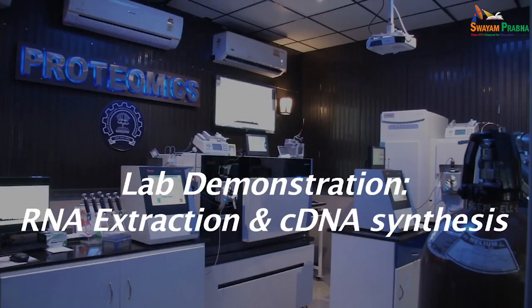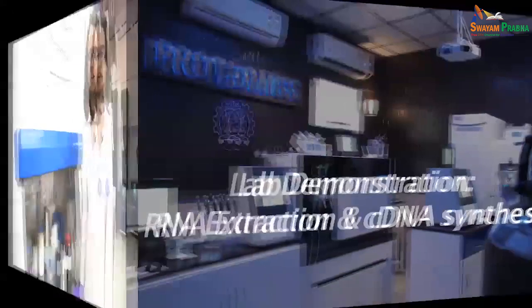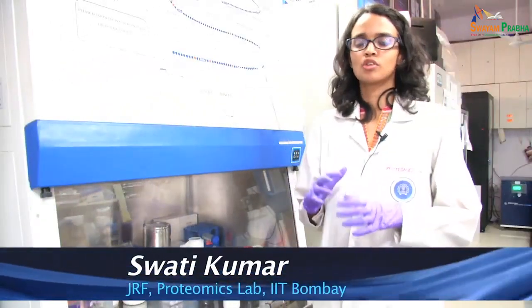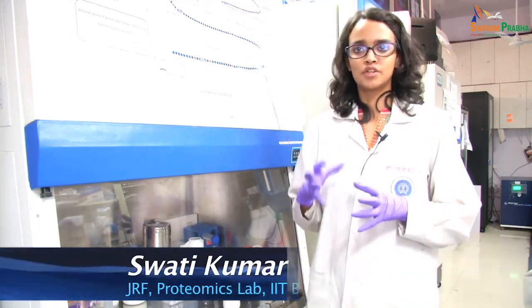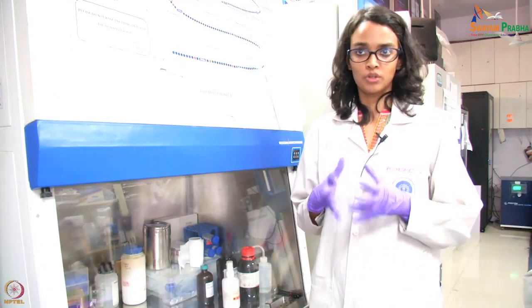Let us start a laboratory demonstration now in which you can see how to make cDNA and then use that for amplification using polymerase chain reaction. Hi, I am Swati and I am one of the PAs for this course. Today I will be explaining the first few steps that are involved in cloning of a human eukaryotic gene.